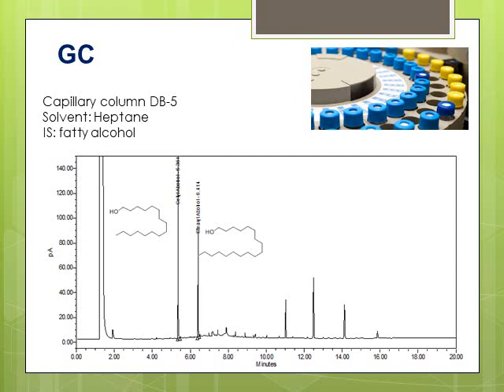Then you could compare this with the raw material that you have in house, and pick a proper raw material for your reverse engineering work. So with the GC you can get amount determination, and also you can do some grade determination, both.